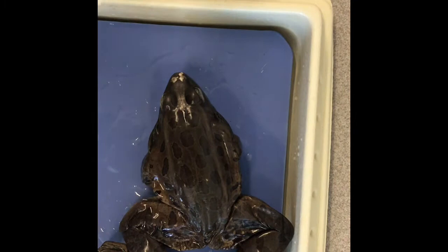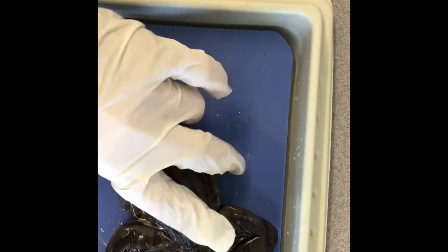Okay guys, here is your frog. A few things to point out. There are two sides of the frog. The dorsal is the back side and the ventral is the belly side.